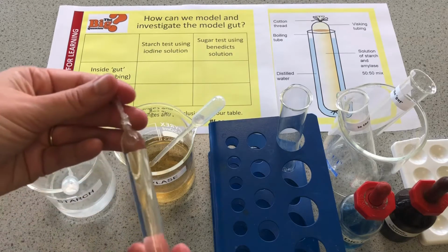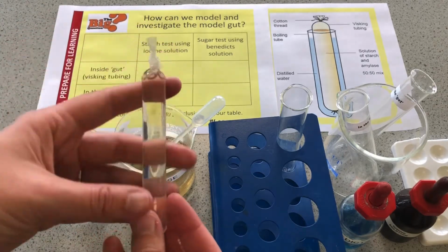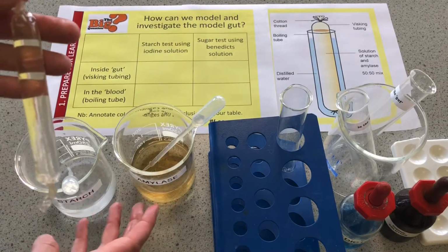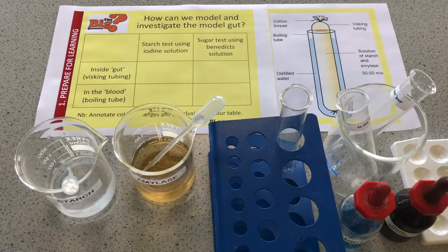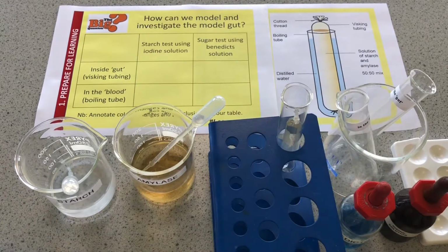So I've now tied that up at the top. I'm going to cut off that bit of Visking tubing at the top there, and that is my contents of my small intestine. So starch, large insoluble molecules, and some amylase. The enzyme's ready to chop up all of that starch. I'm just going to give it a rinse in some water here to make sure I've got no starch on the outside of it.